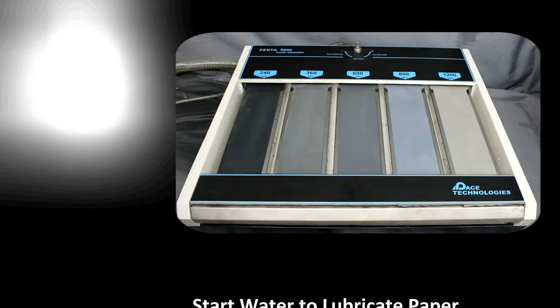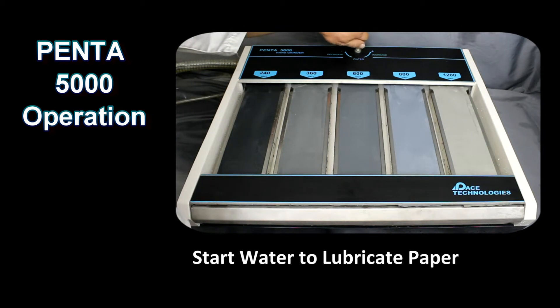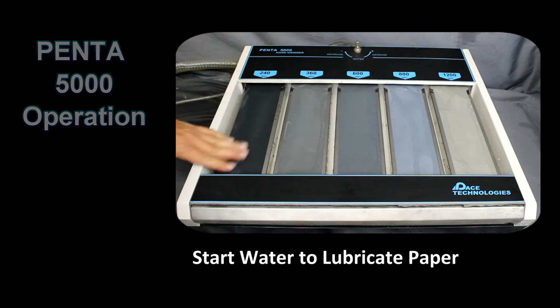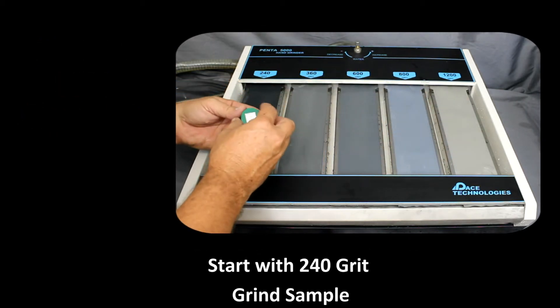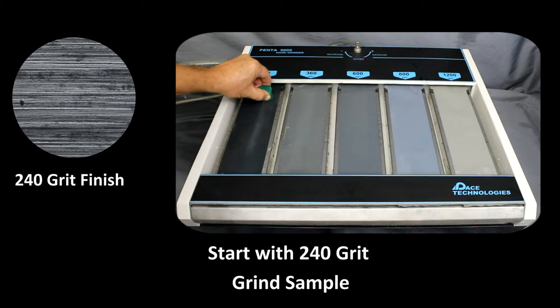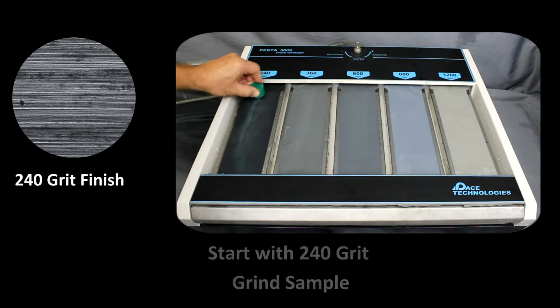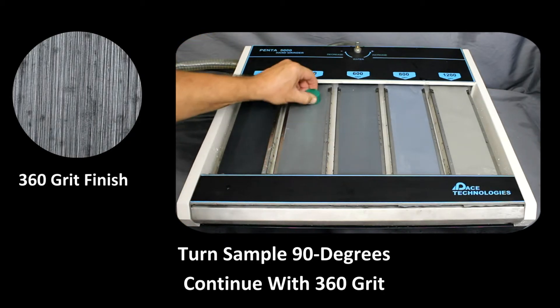The operation of the Penta 5000 is very easy. First, turn on the water. Starting with the 240 grit or coarsest grinding paper, grind the sample in one direction until all the grinding marks and initial damage are removed. Turn the sample 90 degrees and move to the 360 grit paper. Grind at this station until all the grinding scratches are oriented in that direction.